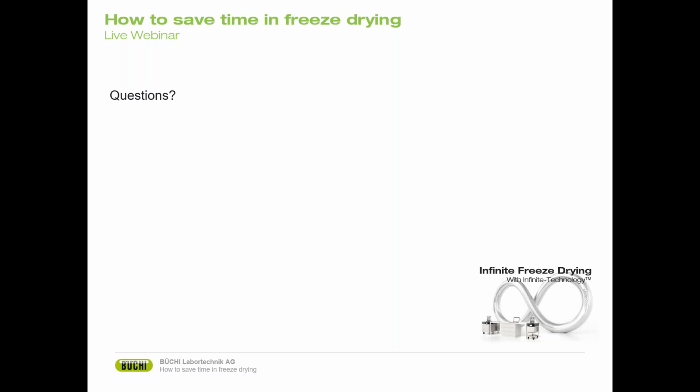Okay, thank you very much, Ulrike. Then we have a question for Moritz. You mentioned that the freeze drying run of the strawberries was untypical because of the constant decrease in the pressure. What do you think might be the reason for that?